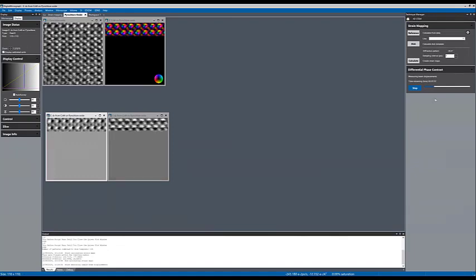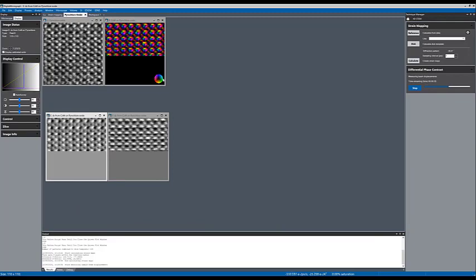And if I had put in a rotation angle, it would have given me these deflections with that angle applied. And this color map that you're seeing is basically the vector map, the beam displacement vector map. And this color wheel is telling you the direction of the vector in this vector map.